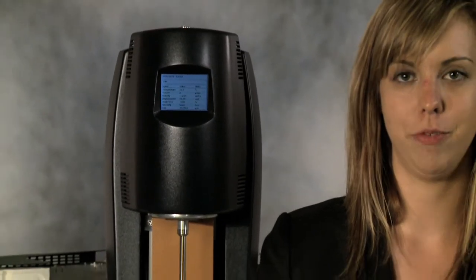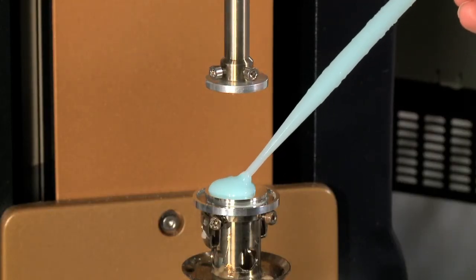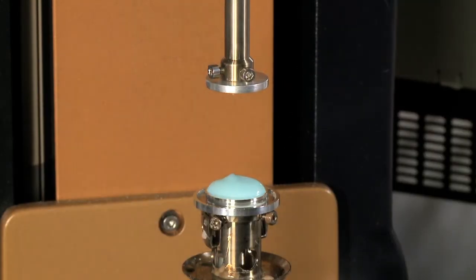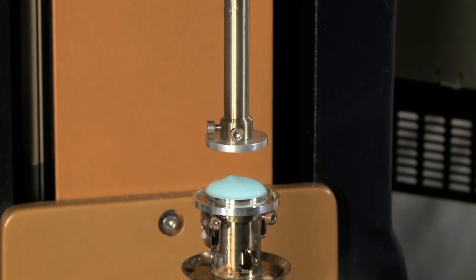Samples that go through a curing reaction can be some of the most challenging to measure on the rheometer. Over the course of the test, the sample goes from a medium viscosity liquid to a rigid solid. The change in modulus can be very large and occurs over a short period of time.